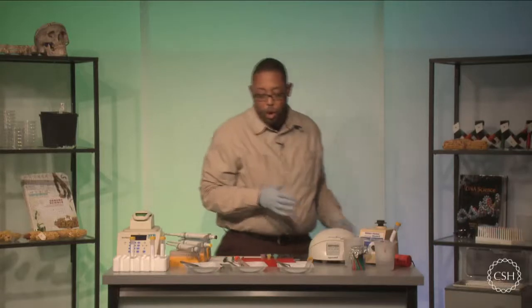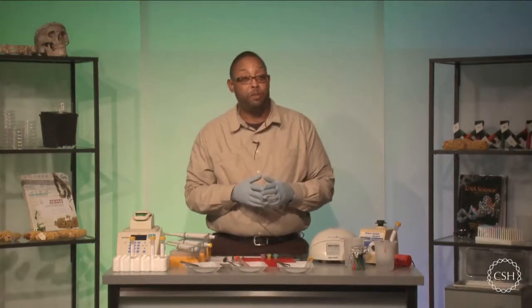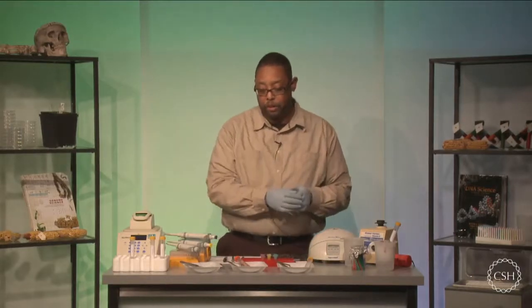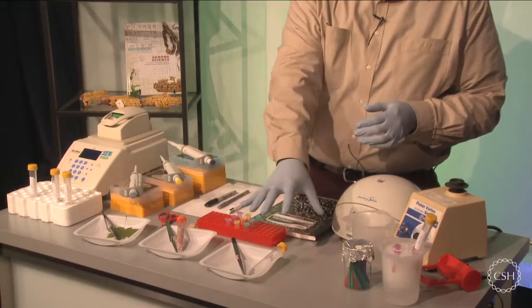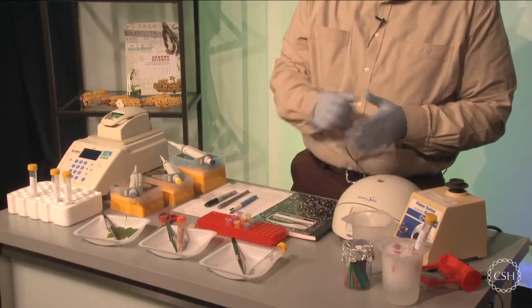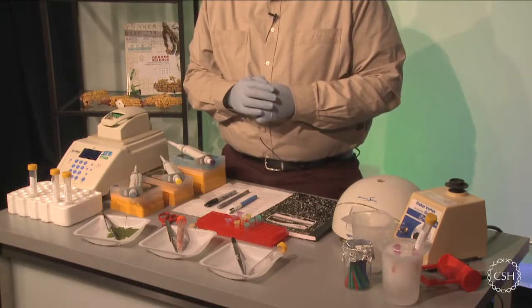All right, so let's talk about everything that you're going to physically need here. First things first, you're going to need some samples. So I have three sets of samples here, and I have some plants, some sort of meat. This is pork, actually, and I have an insect here, which is actually going to be my house cricket. I'll pull these out in just a second, but we still have numerous other things to physically go through here.